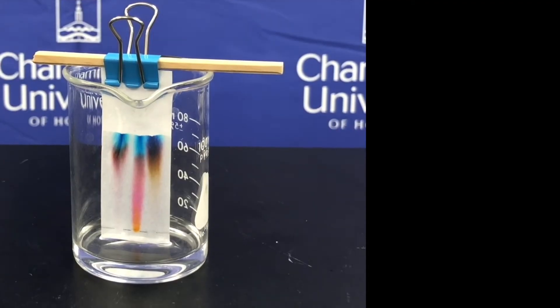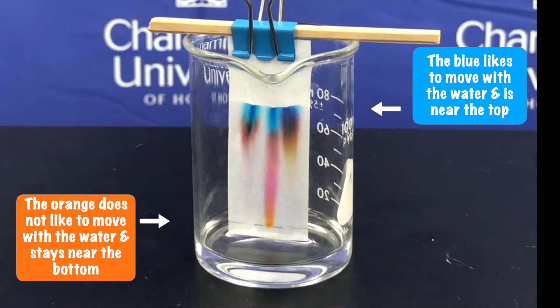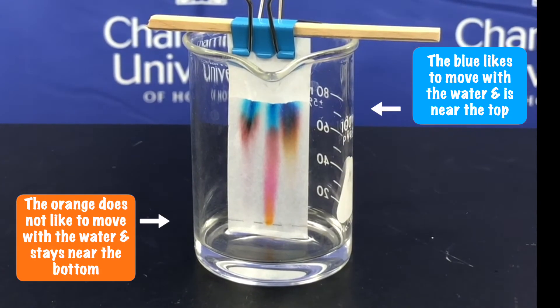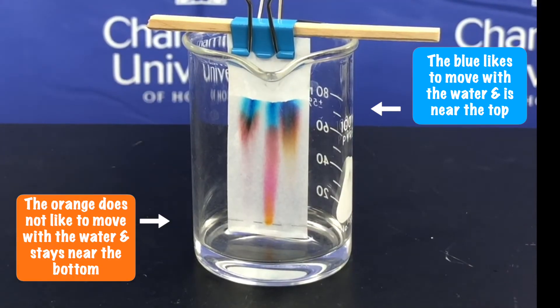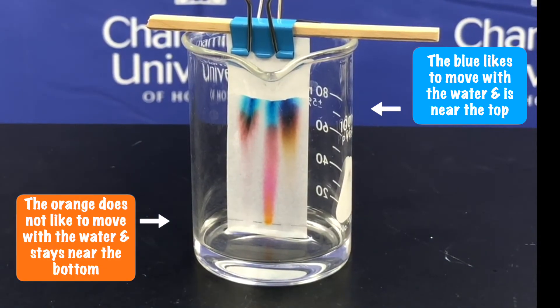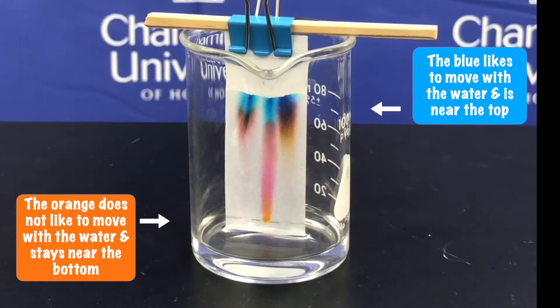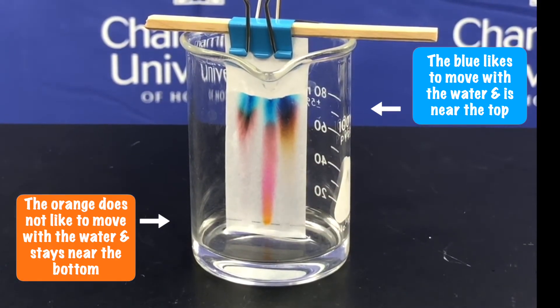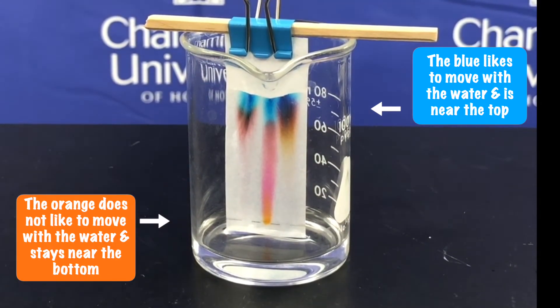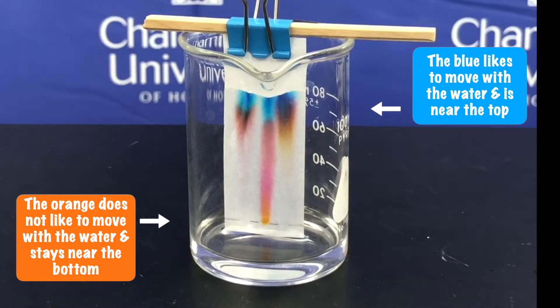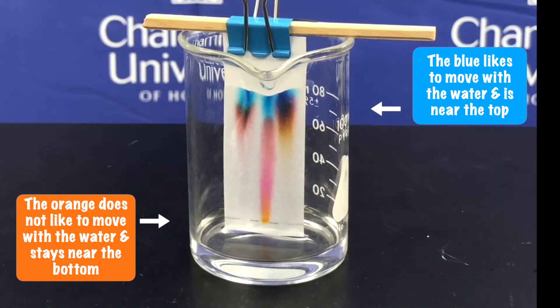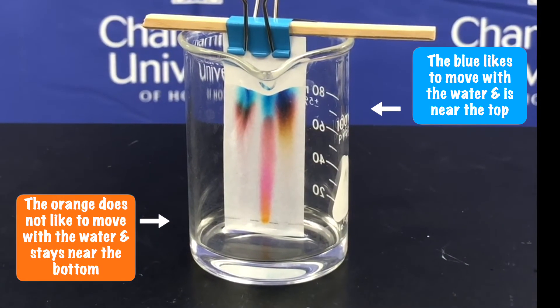So in this example, we can see that the yellow orange color at the very bottom of the piece of paper actually doesn't really like to move with the water very much and sticks around near the bottom of the chromatography paper. However, the blues at the top of the paper like to move with the water quite a bit, and so they move upwards towards the top.